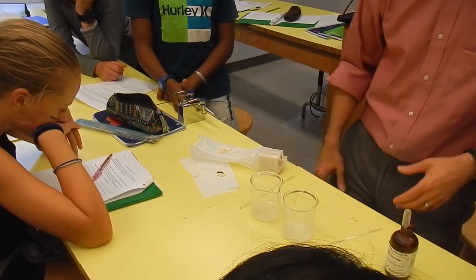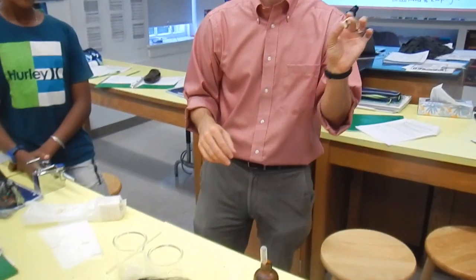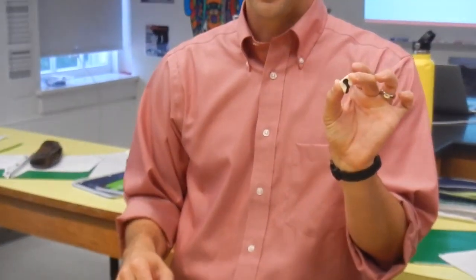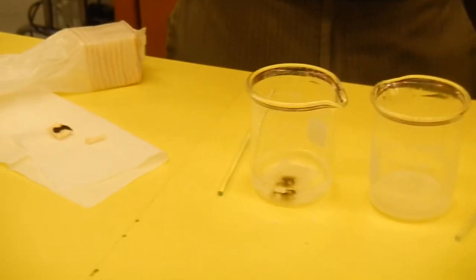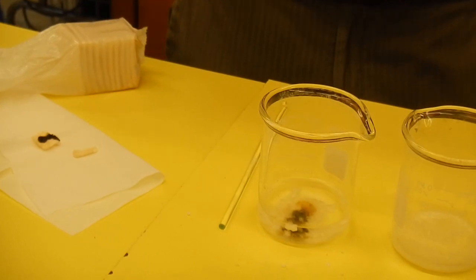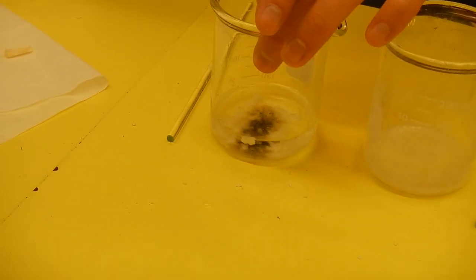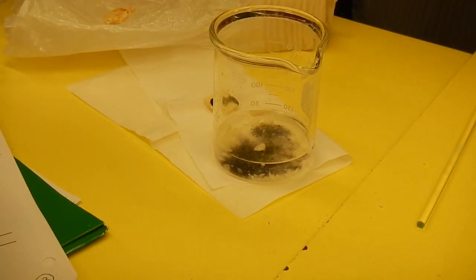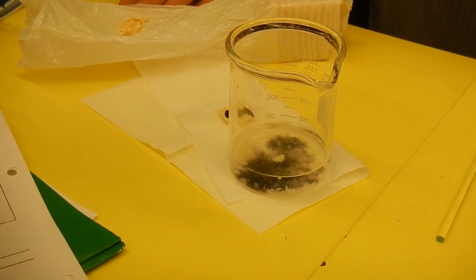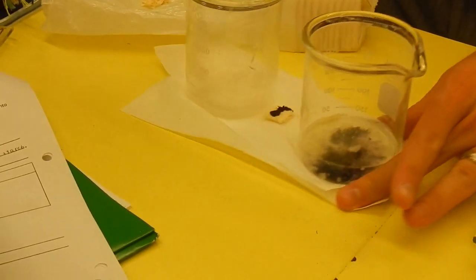Now this is also, we'll get to that later. I'm going to focus on the pretty blue color. Indigo. This is a dark blue, officially a dark blue. Shine into the one with water. It's green probably because of the yellow table that's underneath it. Let me move it. Oh, that's blue. So you've got the blue-black or purple, whatever you want to call it. Bruise.